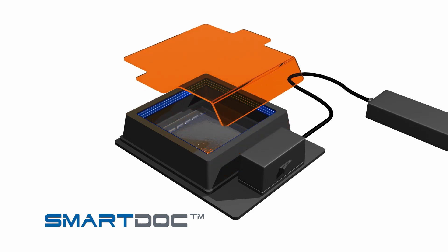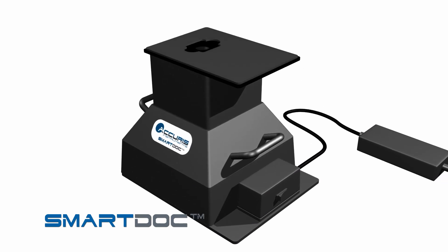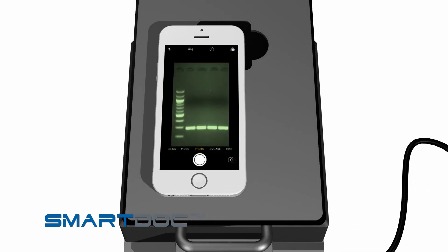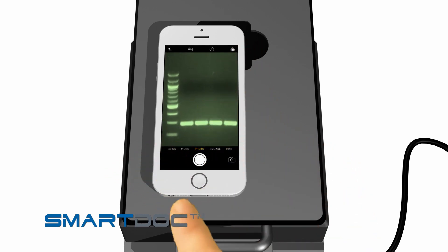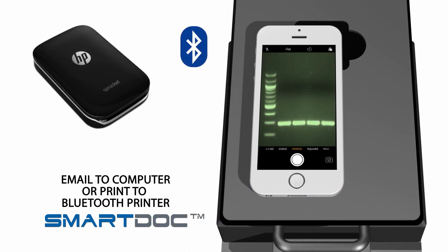To take a picture of the gel using a smartphone camera, remove the filter cover and place the imaging enclosure onto the illumination base. Insert the orange photo filter into the top platform. Open your camera app and align the camera lens with the photo filter on the platform. Use your camera's zoom and focus features to optimize the image, then snap a picture. You can now email the image to transfer it to your computer or even print directly using a Bluetooth printer, such as an HP Sprocket.